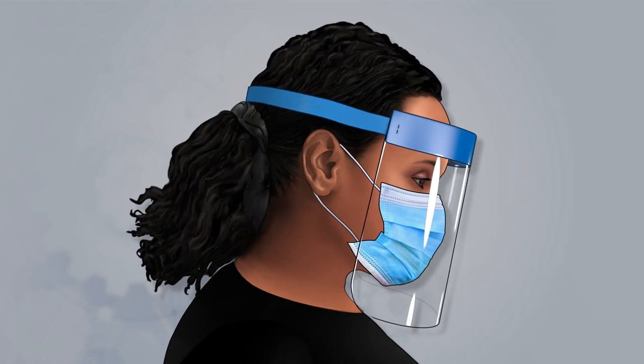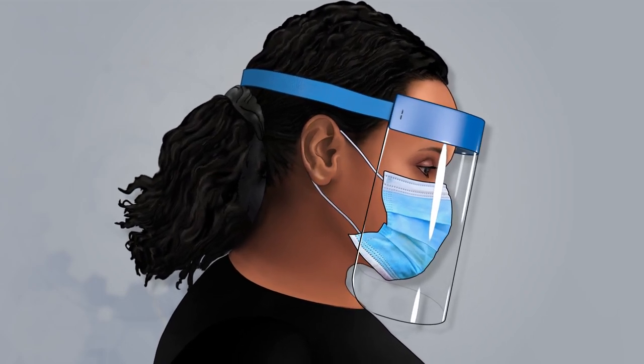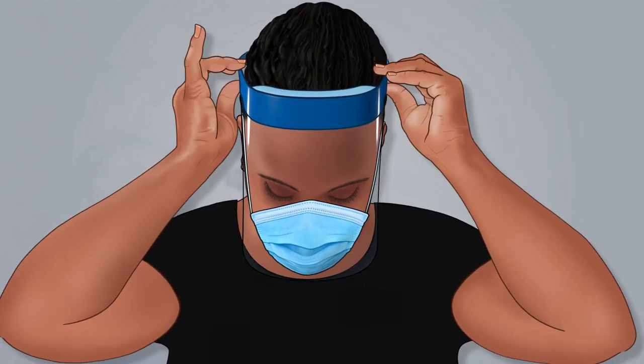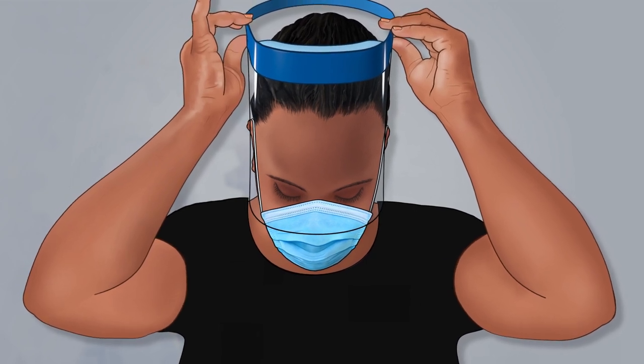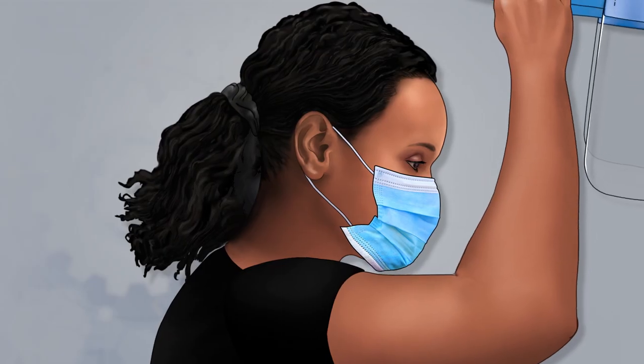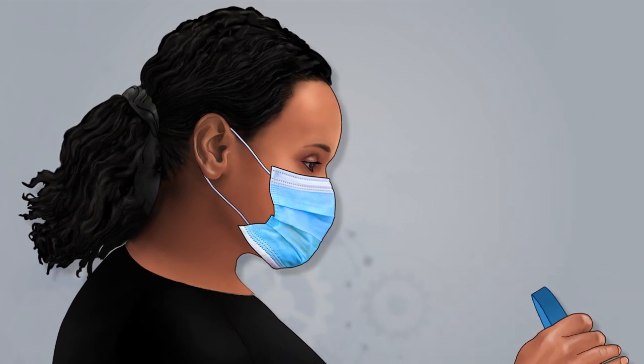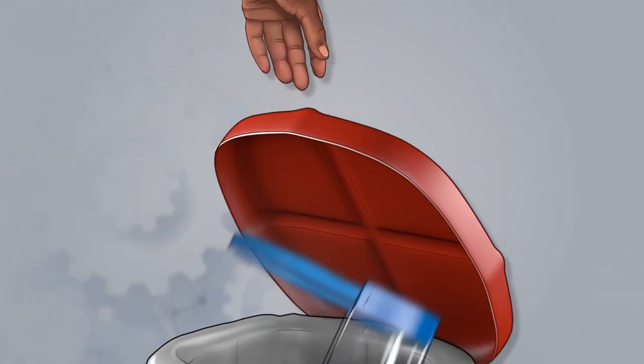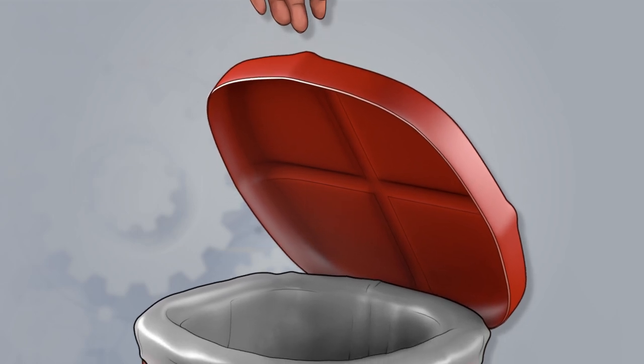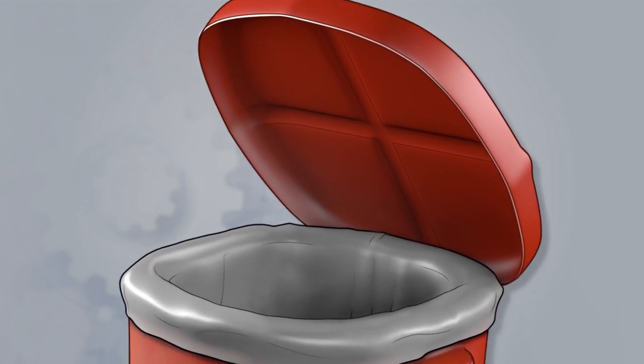Tilt your head slightly forward to take off your face shield. Grasp the straps above the ears and gently lift the face shield away from your face, taking care to avoid touching the shield itself which may be potentially contaminated. Then, discard the disposable face shield in the biohazard waste container.